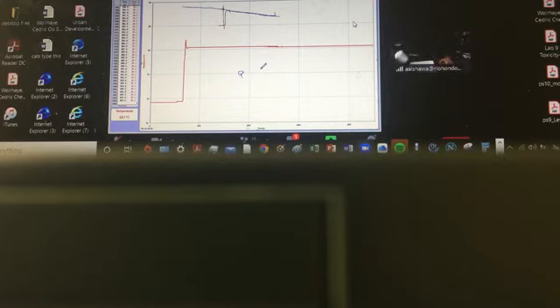So assuming here's another setup. Here's the cup. Inside of it is water, and I dipped in metal, heated metal. Now, the water and the metal together exchange heat. Upon the exchange, if the metal delivered heat, because it's going to cool down, it's going to deliver heat to who? To the water inside that calorimeter.